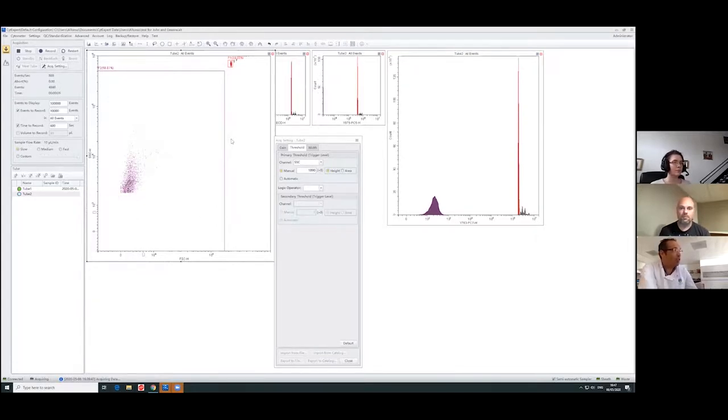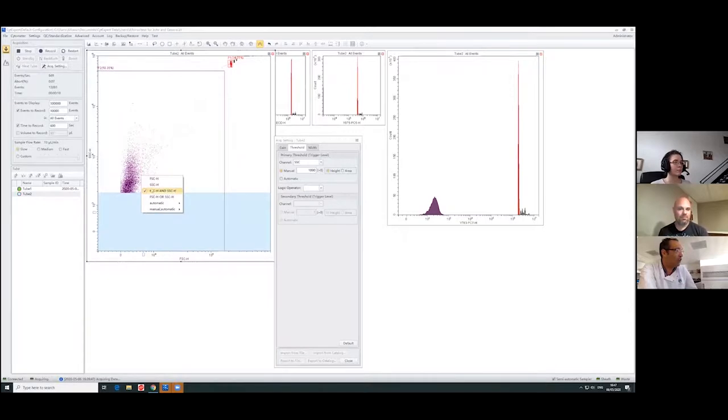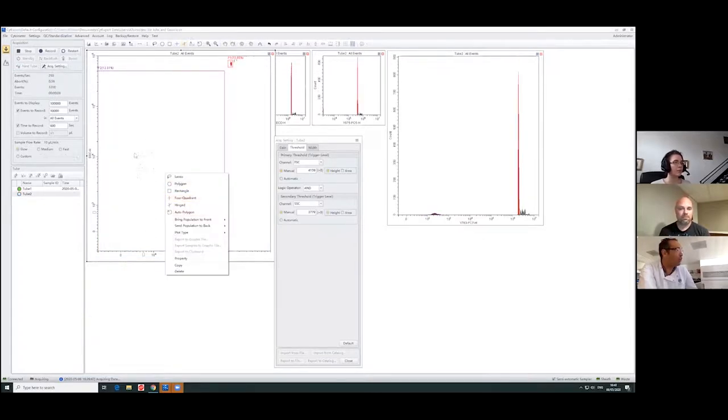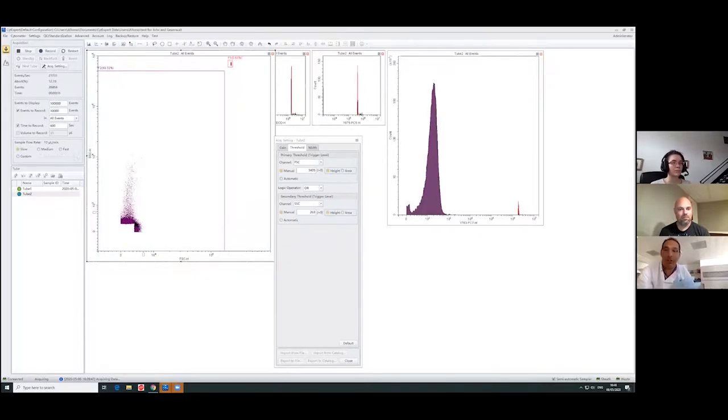What we can do as well is a threshold combining forward scatter or side scatter, or forward scatter and side scatter. So we can say "and". Okay, forward scatter and side scatter. Oops, sorry. And I want to remove all this noise. Or I can combine this threshold with forward scatter or side scatter, so you can see where the noise is coming in, in one place or the other. Okay, so you can put your limits.